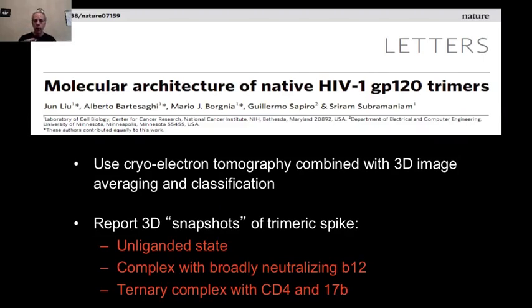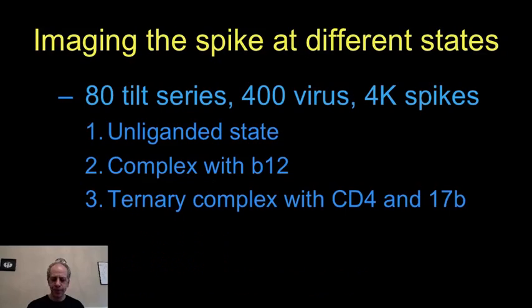And I was lucky to work on this with people at NIH, at the National Institutes of Health, and I'm going to show you some results of this, and much more research has been done on this area, but this is important and enough to illustrate the example for this image processing class. And normally what you do is you basically have the virus in different states, and then you try to look at this 3D shape in different states.